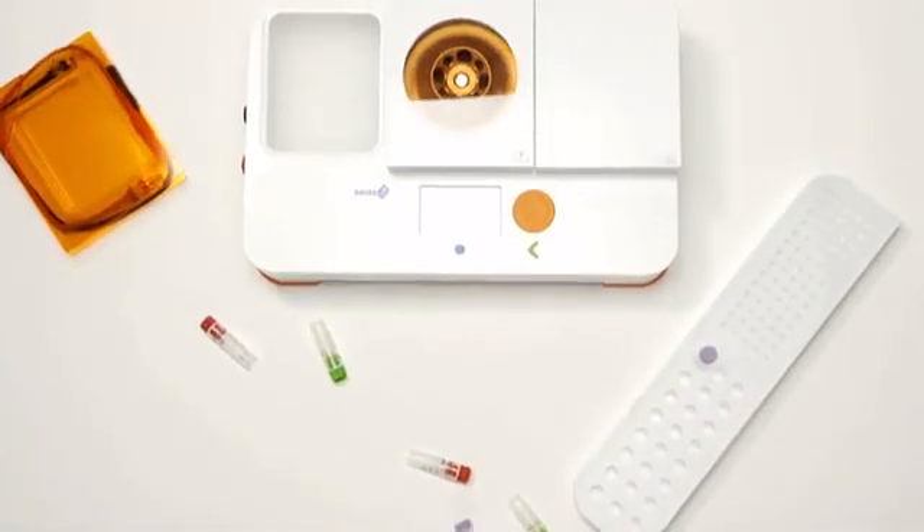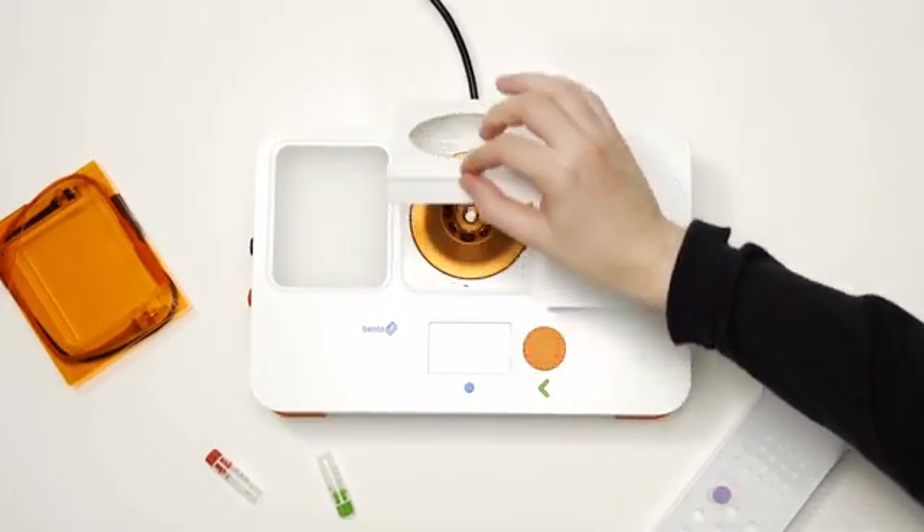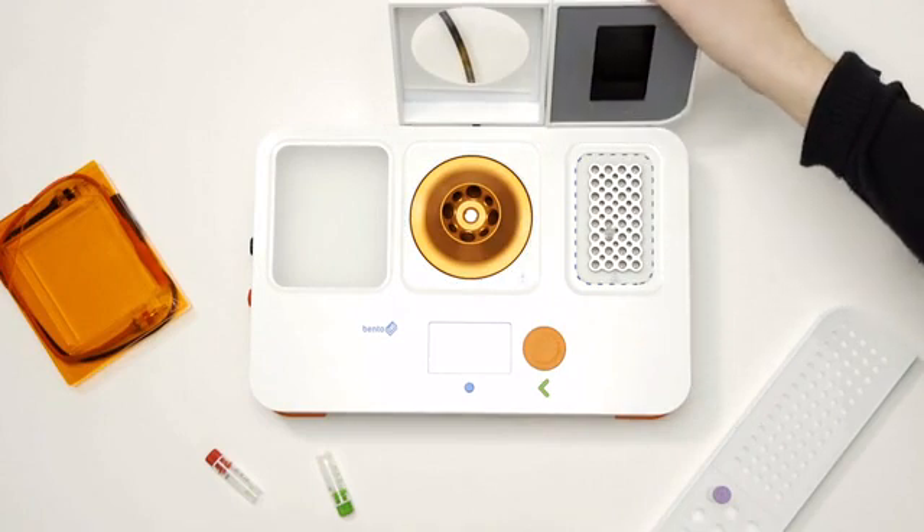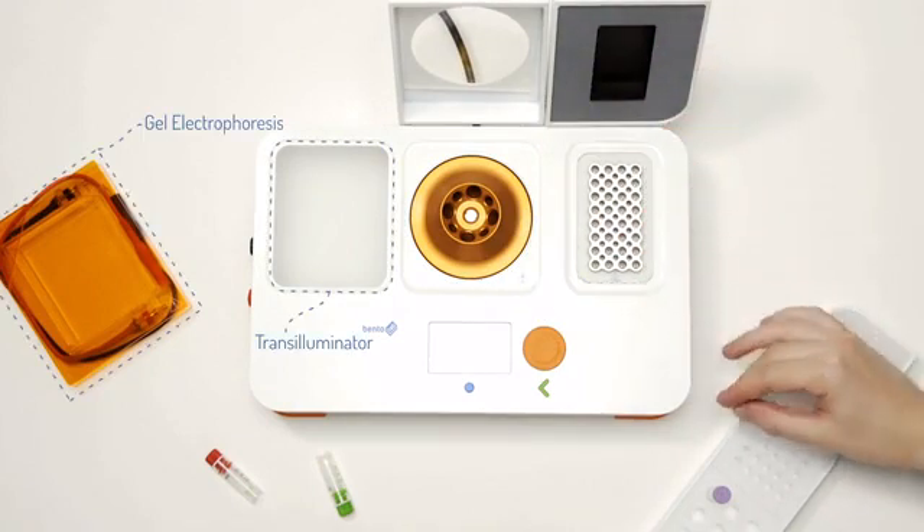That's what BentoLab is. It brings together all the essential tools for molecular biology. You've got a centrifuge to extract DNA, a PCR machine to copy genes, and a gel unit to visualise DNA.